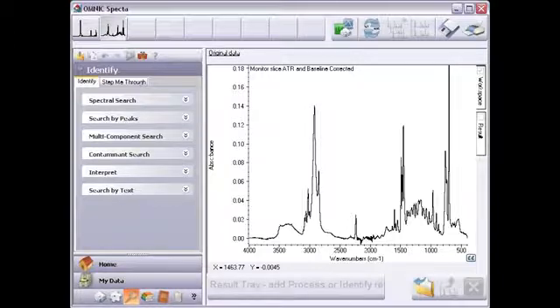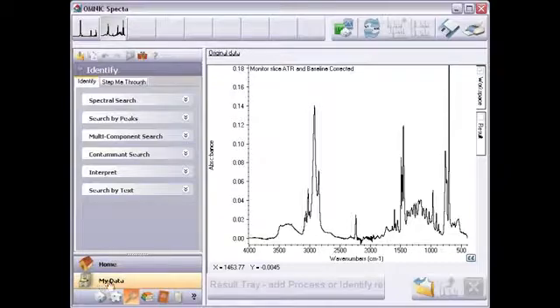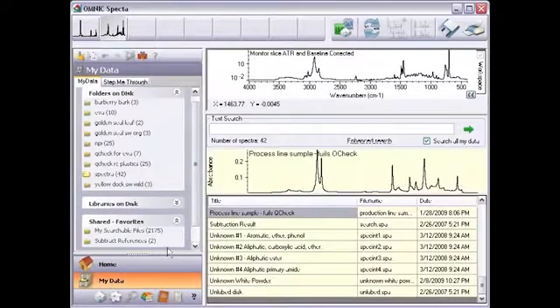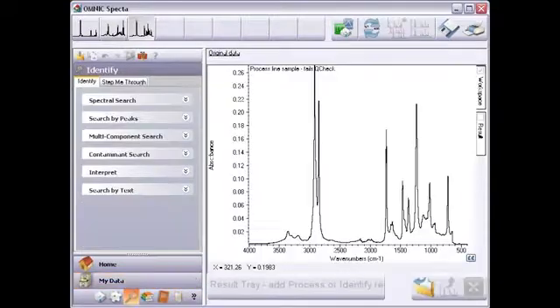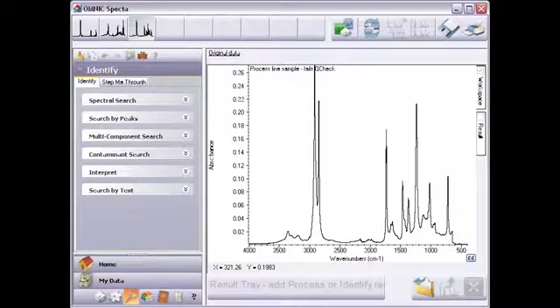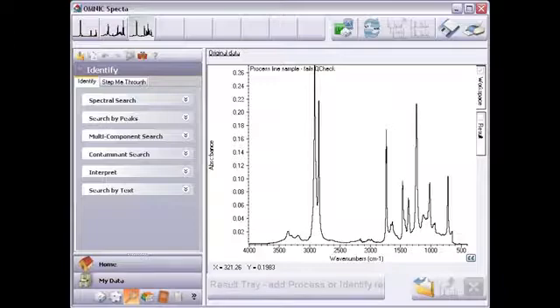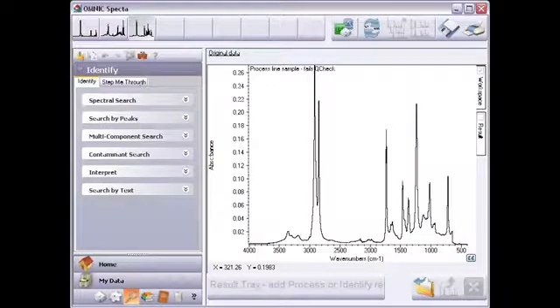I'll demonstrate how Specta's Identify tools work together to quickly solve this kind of problem. This spectrum is from ethylene vinyl acetate, a common packaging material which I will call EVA. The factory specification requires 18% of the EVA component in the final product. Initial testing showed the material was out of specification. Something else is present.